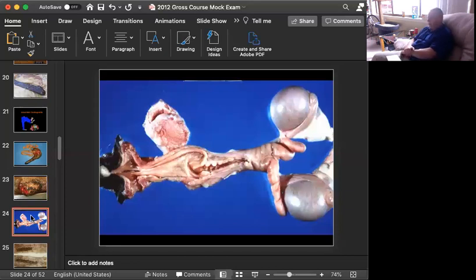Okay, time's up. Goats probably have more of these than any other species of animal. They tend to go hand in hand with polled genotypes. And what we're looking at is the reproductive tract that is laid out, and this particular form of laying it out goes all the way back to Dr. Ken McEntee in his reproductive pathology in mammals book back in the 50s. And everybody does it now.